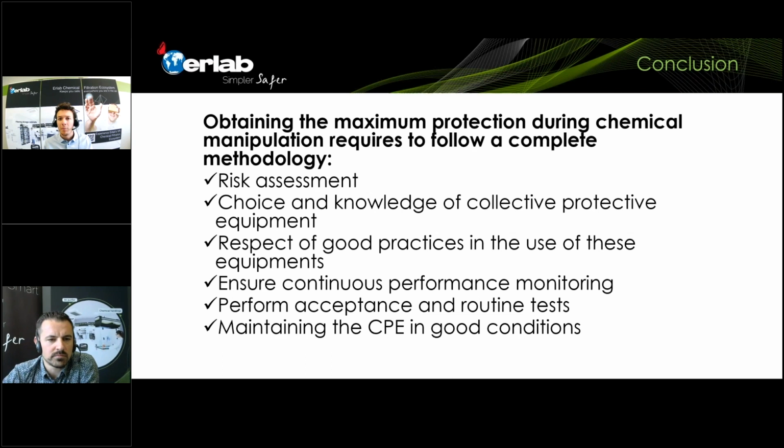So yes, you can use acetone because the activated carbon filter that we have for acids is also a filter which will filter solvents, so it will filter both solvents and acids. So of course, if the acetone goes through the filter, it gives you as well an indication about the capacity of the filter to absorb acids. So yes, you can use acetone. So I hope it answers your question, Eddie. And if it doesn't, please just let us know by writing on the chat interface or questions interface.